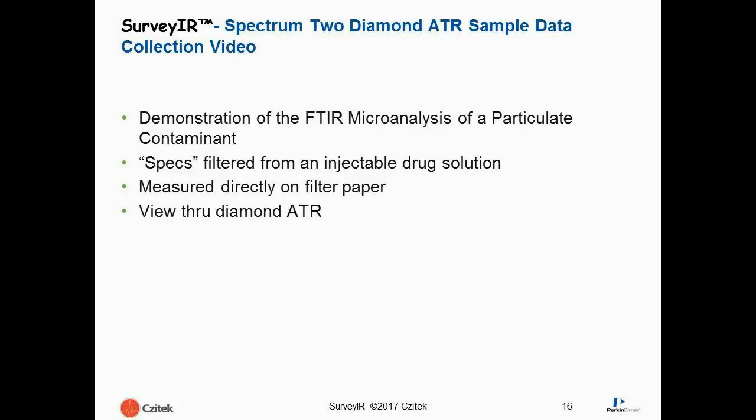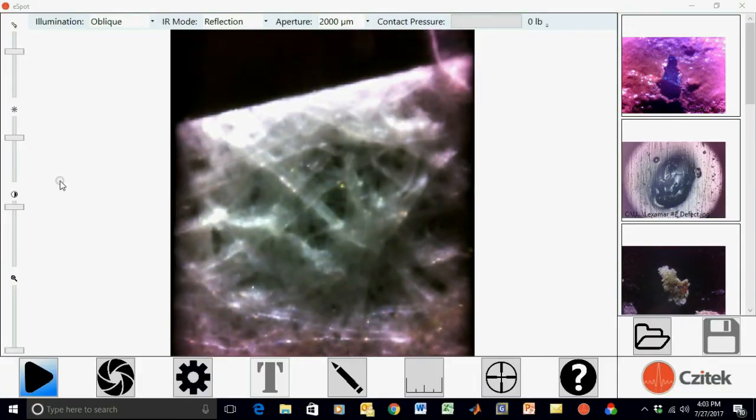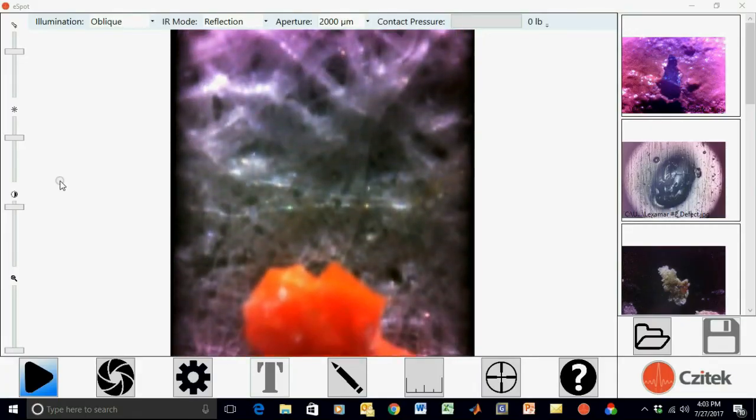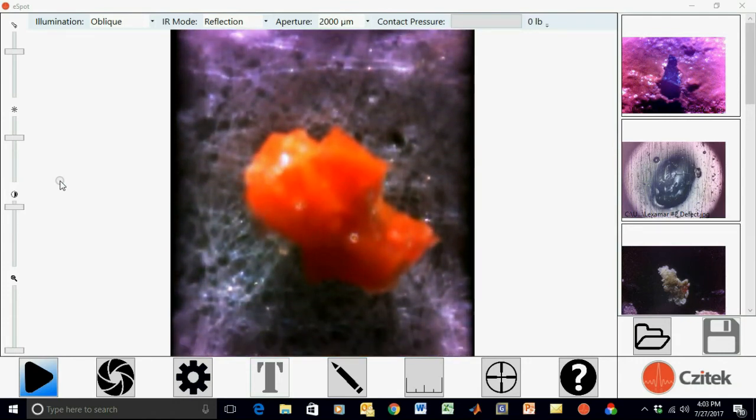We'll now demonstrate a sample analysis using Surveyor with Spectrum II. In this case, we'll analyze a particulate contaminant isolated from an injectable drug solution. Small particles barely visible to the human eye were filtered from the solution and measured directly on filter paper. We used the view-through Diamond ATR in this analysis. The filter paper sample was mounted on a low-E glass slide and placed on Surveyor.